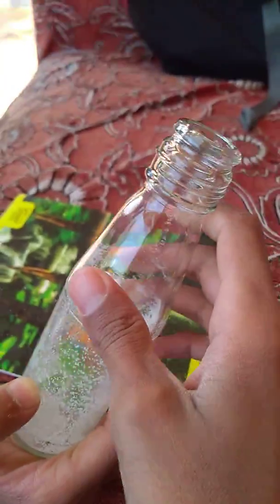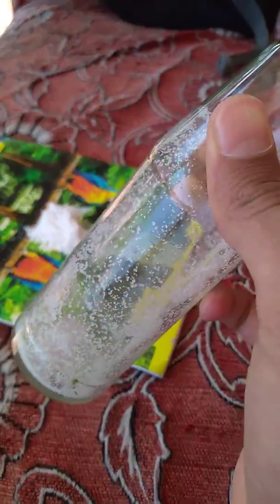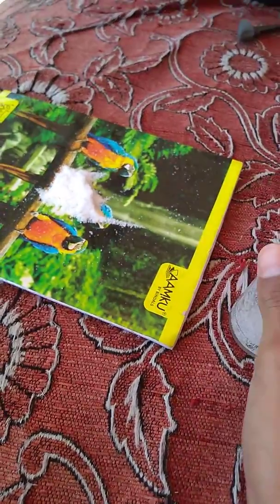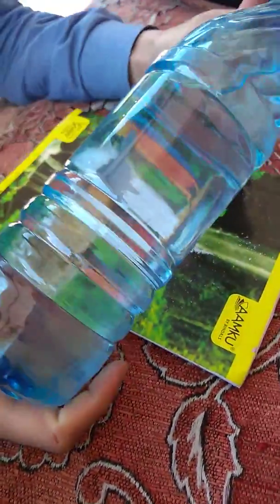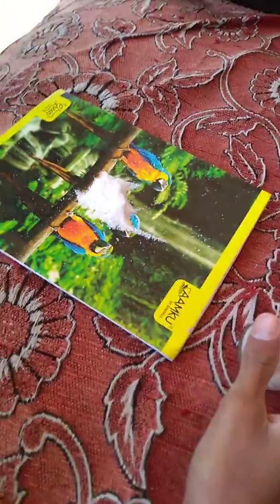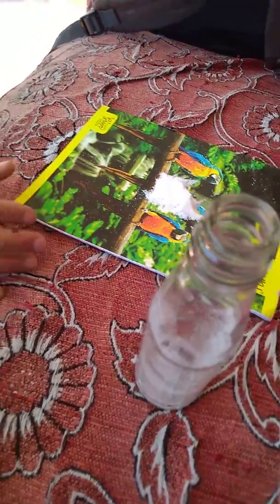This is a glass bottle — some sodium chloride is already present in this, and now we are putting some more. This is dilute sulfuric acid. Now let us put this sodium chloride into this bottle.